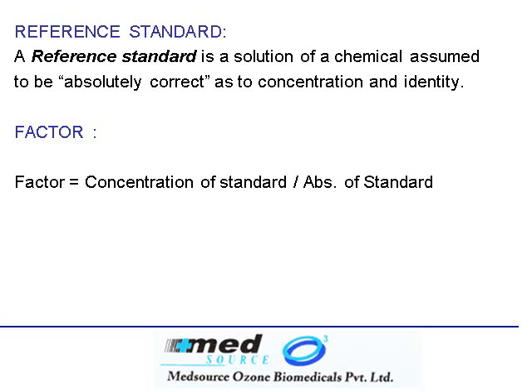Let's say we take a glass of water and we put 5 drops of ink and we run this sample in a spectrophotometer. Typically, what we will get will be an absorbance of, let us say, 0.5 units. Now, if we put the other solution which has 20 drops of ink, what we will get will be an absorbance of 2 units. So 5 drops was giving 0.5 absorbance, and therefore 20 drops, which is 4 times the drops, will give 4 times the absorbance, or 2.0 absorbance.